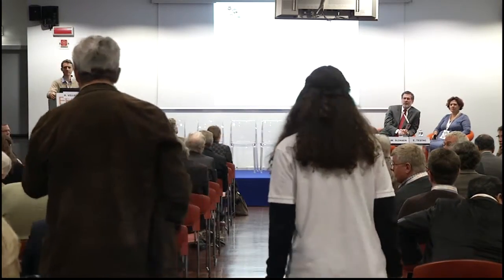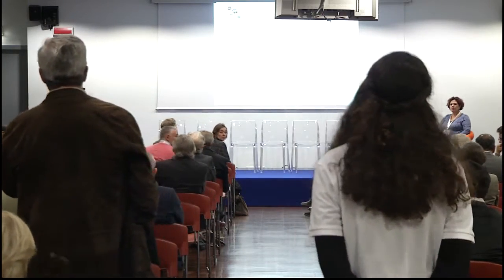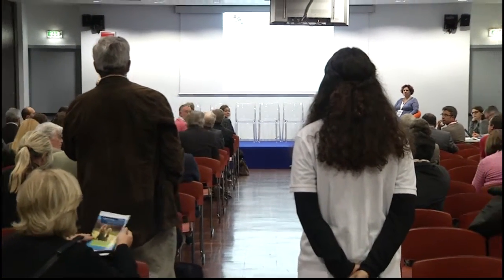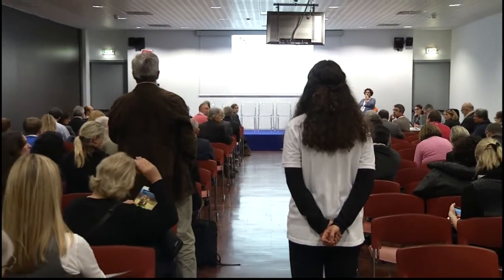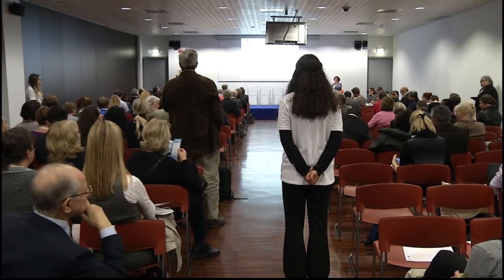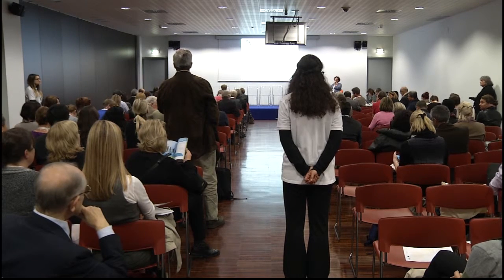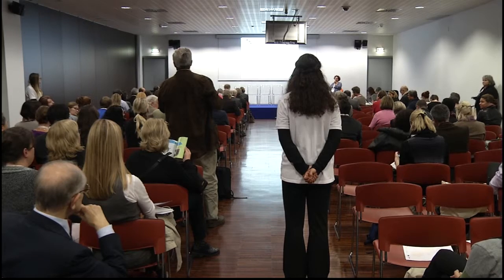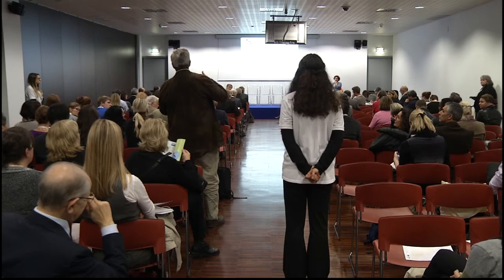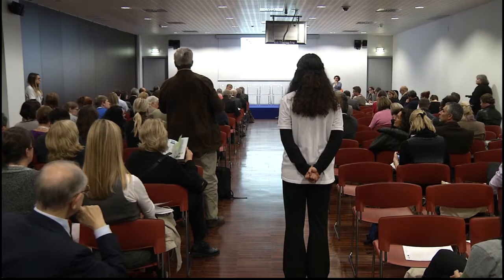Hi, Harvey Kluhl, the Hamner. It really is impressive how you can reproduce normal biology at the chip level of scale. As I recall, that DARPA funding had a goal of also being able to produce in vivo relevant plasma concentration profiles of drugs. I'm wondering how that's coming along, because we have trouble at the plate level trying to get chemicals to get to the cells rather than be absorbed on all the tubing, and surface to volume problems increase as you go down in scale.